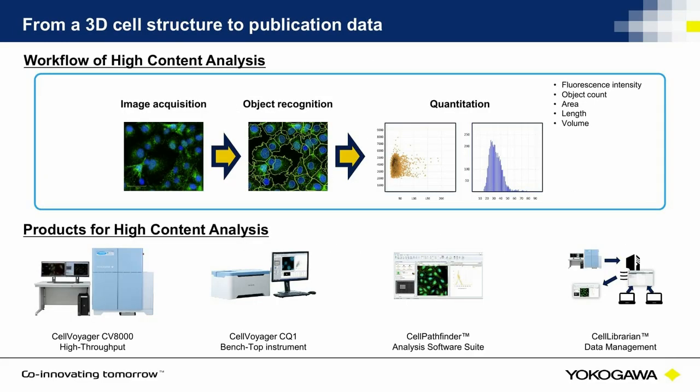In either two-dimensional or three-dimensional high-content imaging, we look at a very general workflow. The image plane with the cells of interest is acquired, and from this image plane, the analysis software identifies countable objects of interest. Here, in more and more applications, artificial intelligence supports the users. Those objects are counted and graphically displayed to address the researcher's question. The object of interest can simply be fluorescence intensity, but also a count of objects like nuclei or mitochondria, or the whole volume of a cell colony.